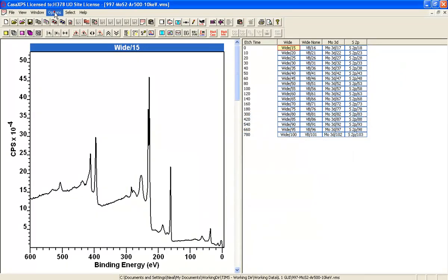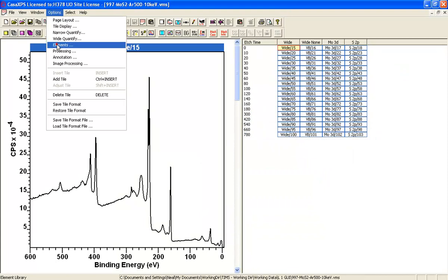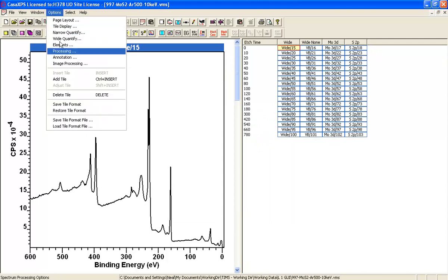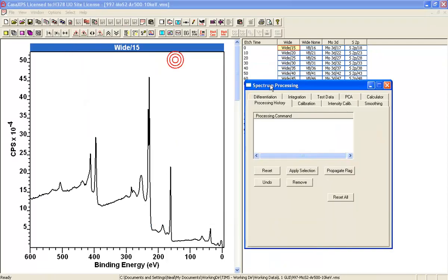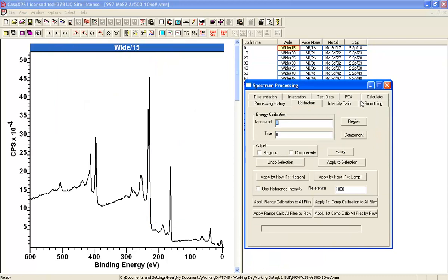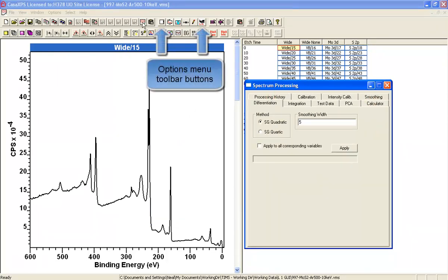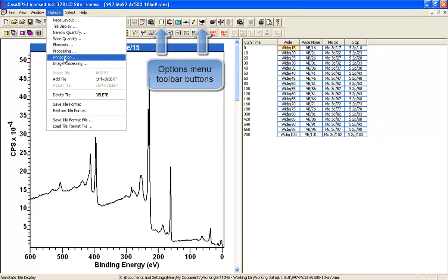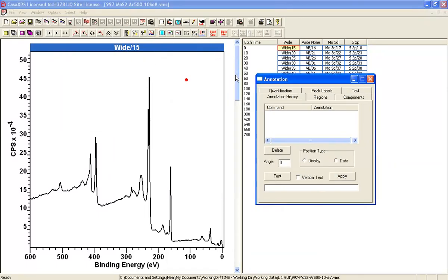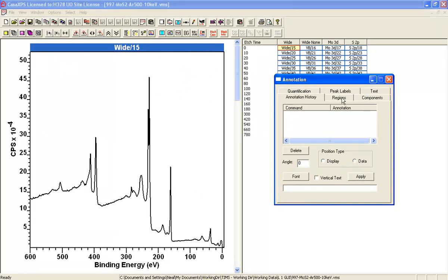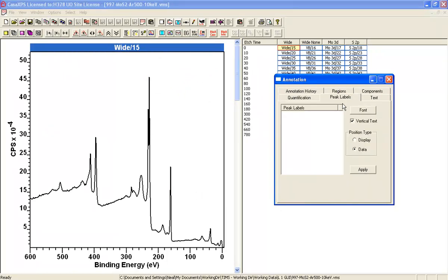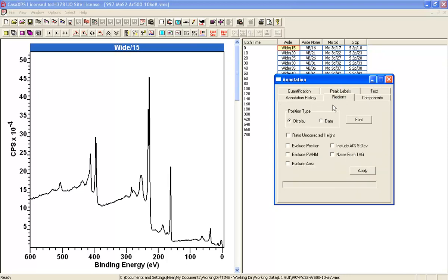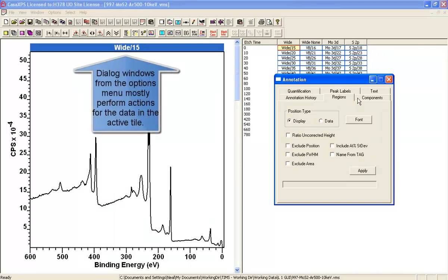You also have the element library. Processing allows you to energy calibrate, smooth, or differentiate spectra. And annotation so that you can mark up peaks with peak labels, add text to the display, and display quantification tables for regions and components.